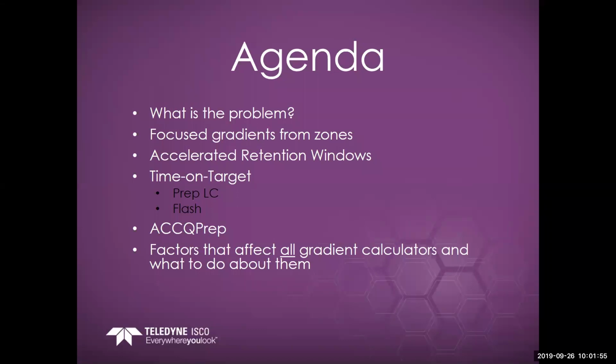And then we're going to talk about different techniques. We're going to talk about the time on target algorithm, which is a slightly different approach to the issue. And then we're going to talk about factors that affect all gradient calculators and what to do about them. And so these issues apply to any of the focused gradient generators.